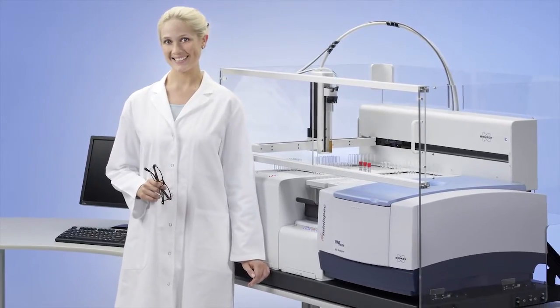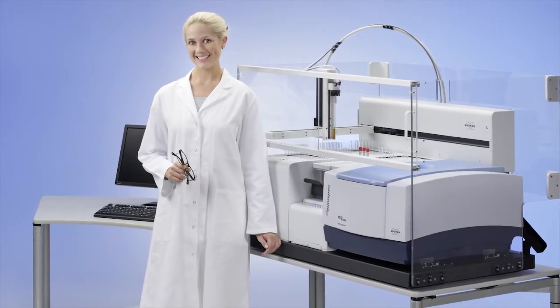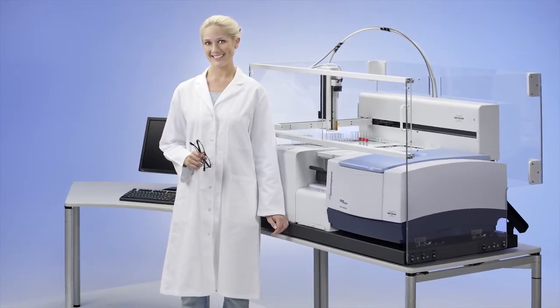The automation fulfills all the requirements of a modern safe workplace and is optionally available with a safety housing.